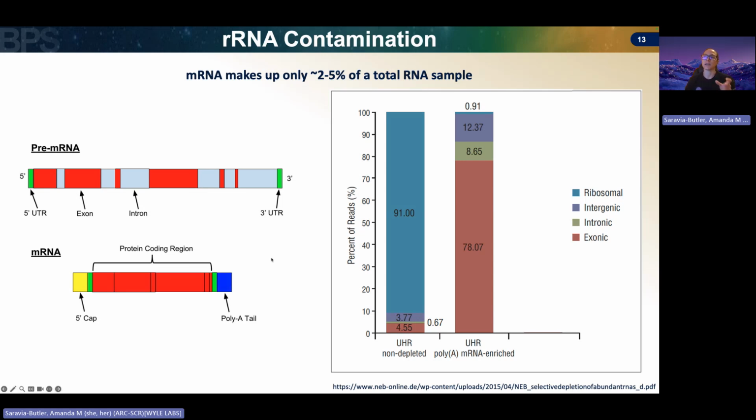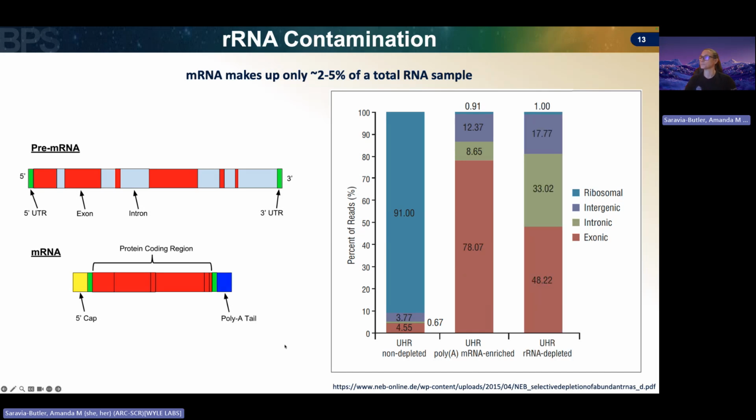And so it's not particularly selective to just messenger RNA. It's selective to RNAs that have long strands of polyadenylation. And so that's why you'll get some of these other types of RNAs in there as well, although the majority of the RNA that you isolate, again, as long as your sample is not degraded, should be messenger RNA.